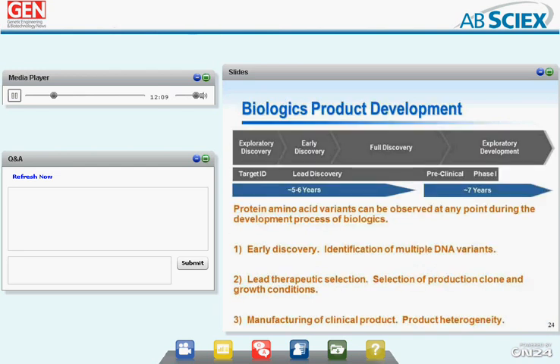When you look at biologics product development, we can divide the product development into four main categories, starting with exploratory discovery, going through early discovery, through full discovery, and finally exploratory development. Much of my work here at Bristol-Myers Squibb is focused on exploratory discovery and early discovery, where we typically focus on target identification and lead discovery of our biologic therapeutic.